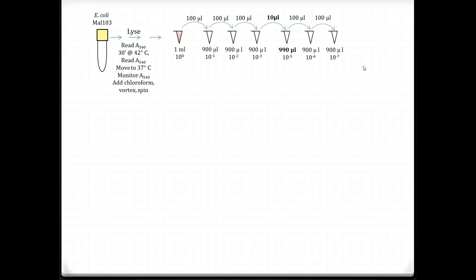So what we're going to do is take some tubes, and you can label them whatever you want. I'll just label them A, B, C, D, and E. And we're going to need to put some E. coli in them. We're going to use the E. coli MC4100. Add 200 microliters of E. coli MC4100 to 4 of them, A, B, C, and D, not to the fifth. That's going to be a control. No cells.